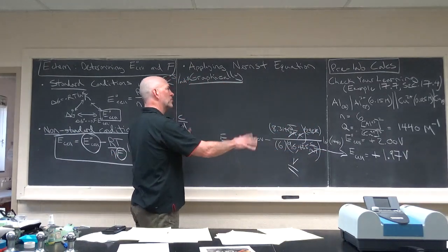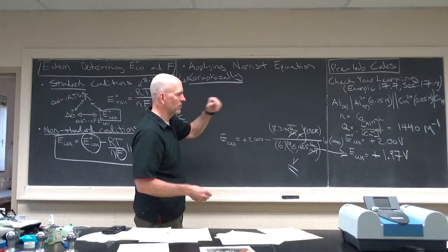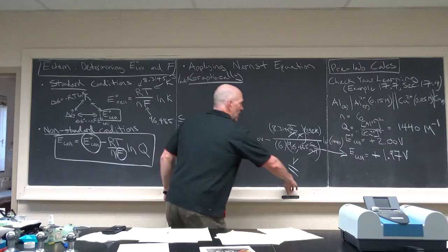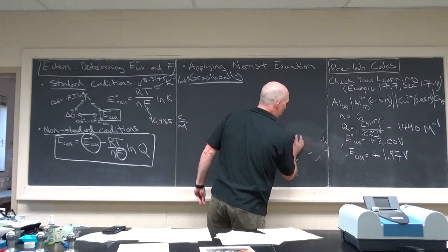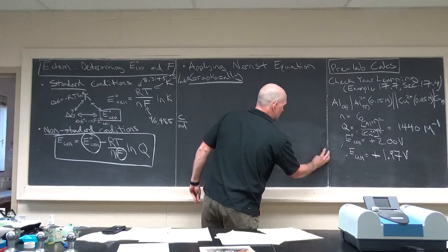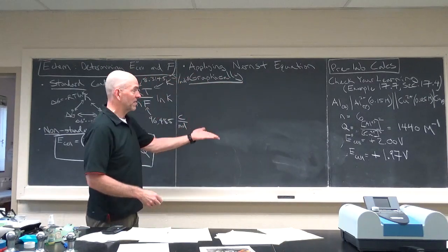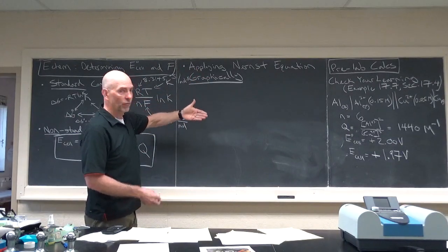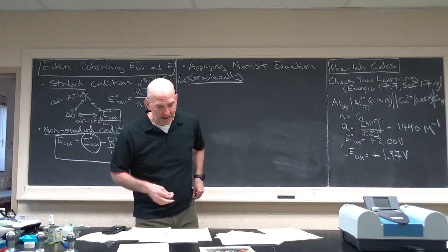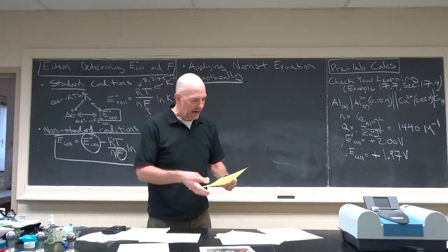So those are pretty standard kinds of problems that you can probably see on a test or your final or something like that. All right, so what are we doing in the lab? That's just the pre-lab, just verify all that stuff that I just did. And if you get this far, that's fine. If you want to try doing a dry lab version of what you're actually going to do, then I'm going to give you some data, and you can give it a shot. You can put it on Excel and do it.